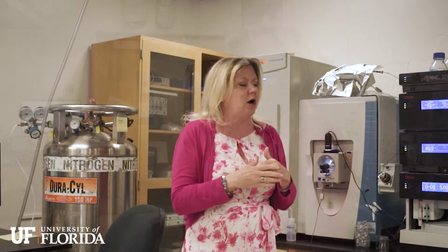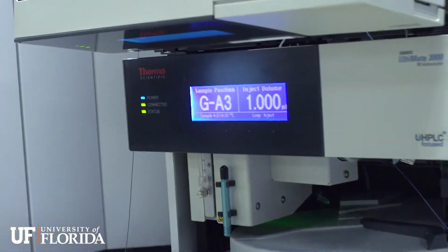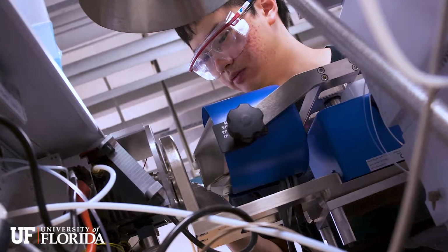Moving on to over here, we have this instrument here, which is a quadrupole time of flight from Bruker, the Impact 2. This instrument is also a high-resolution MSMS instrument, time of flight, quadrupole time of flight. And we predominantly use this for lipidomics and metabolomics, but again, it produces very nice data for intact protein measurement and other measurements that need high resolution. Its resolution is about 60,000.